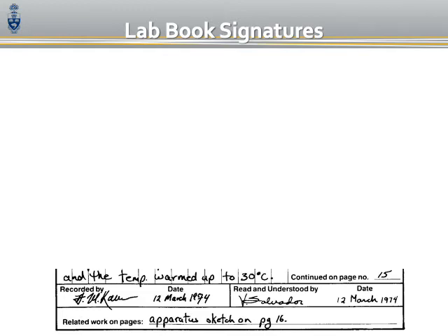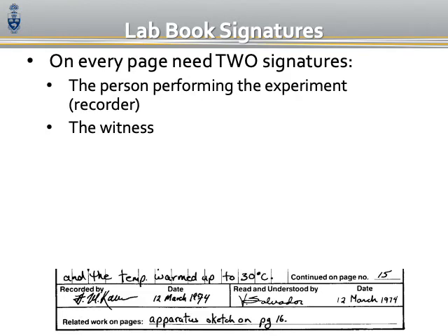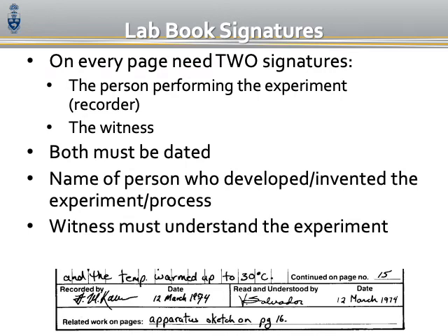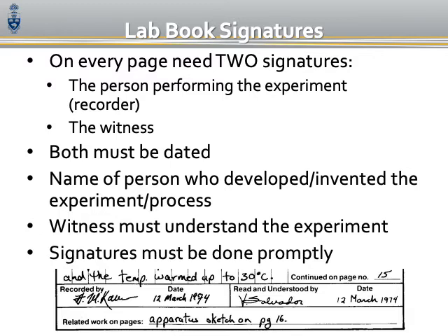Regarding signatures in your lab book: on every page there must be two signatures — the person who performed the experiment and the witness. Both must be dated. One signature is from the person who developed or invented the experiment or process, the other is the witness, who must attest that they understand the experiment. These signatures must be done properly. Typically we're not very strict about this, but it's good practice because when you start working on something crucial that may lead to patents or disputes, this becomes very important.